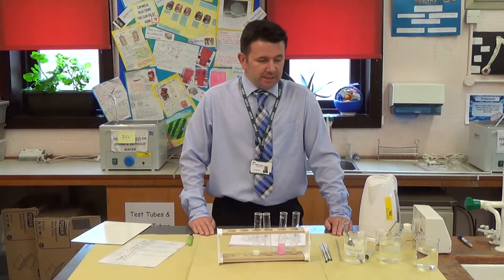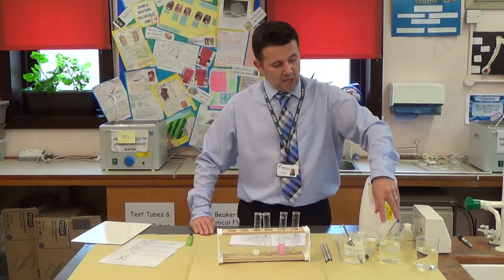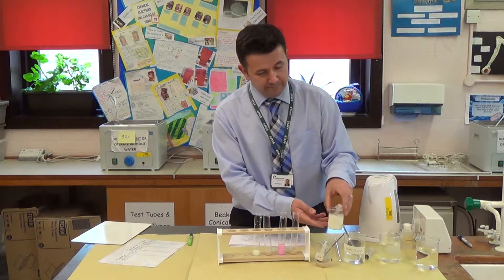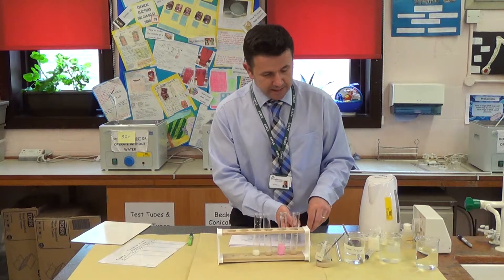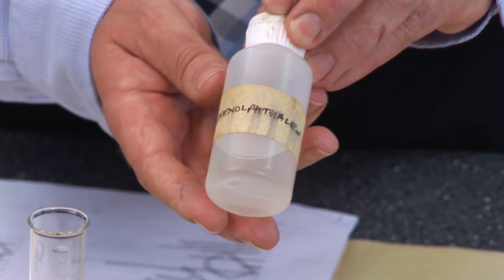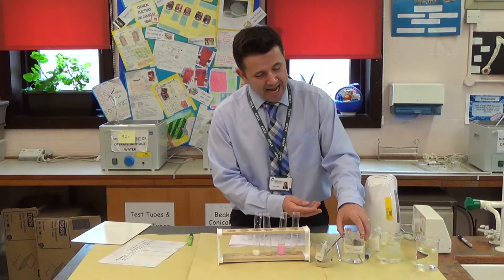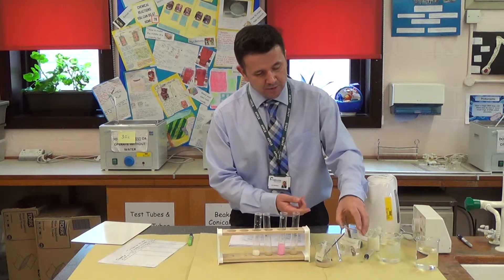To do this, we're going to be using several chemicals. We're going to be using lipase, which is an enzyme. We're going to be using full fat milk. And then we're also going to be using a chemical called phenolphthalein — it's very hard to say — and sodium carbonate, which is an alkaline solution.